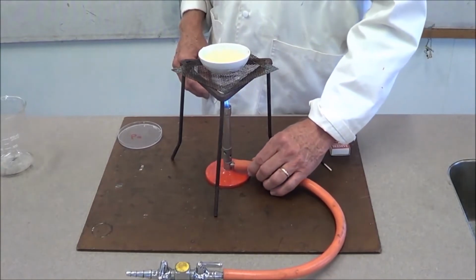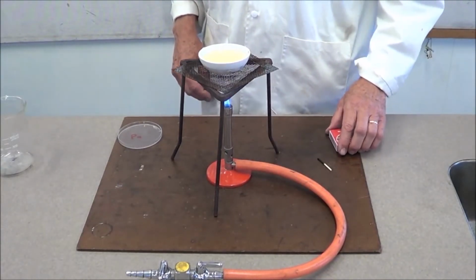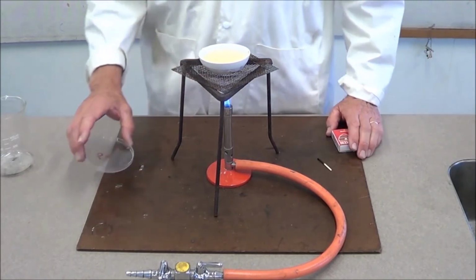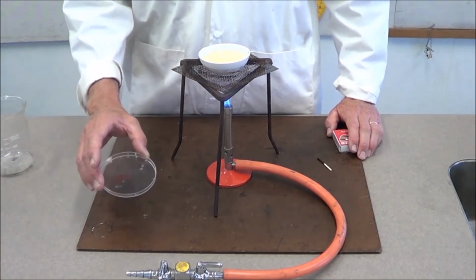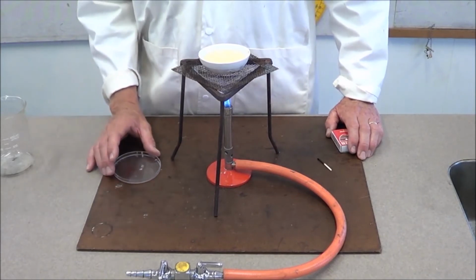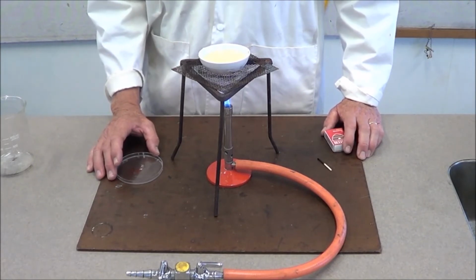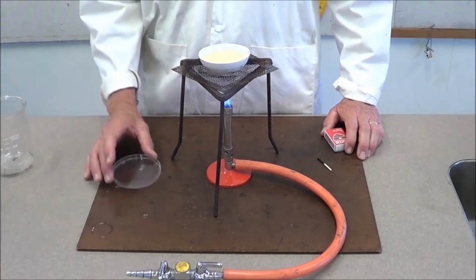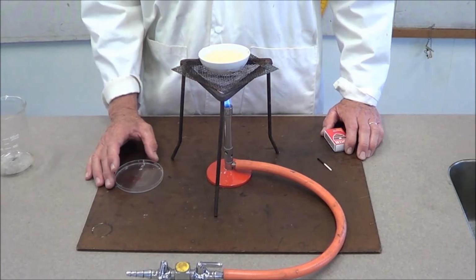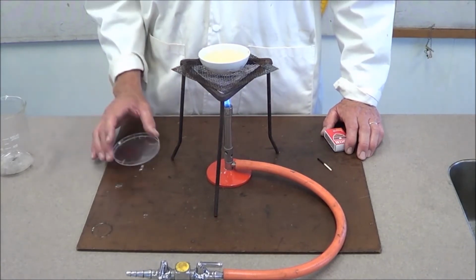And then we heat this to boiling and boil it for 1 minute. Possibly a bit more depending on what your teacher says. In the meantime, have yourself a petri dish labelled. We're going to transfer our solution into there because over the next few days you may do several of these and we have not got enough evaporating dishes, so we're going to let the solution crystallise in a nice clean petri dish. Make sure it's labelled on the underside.